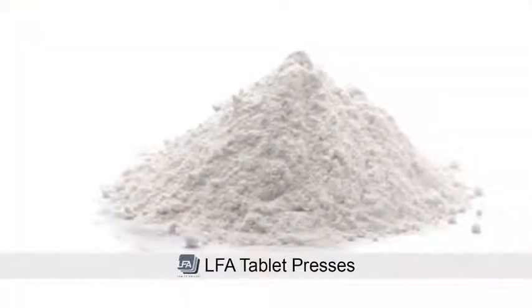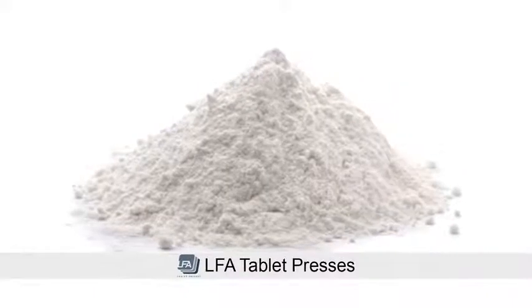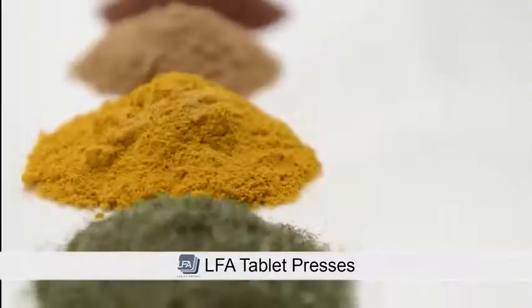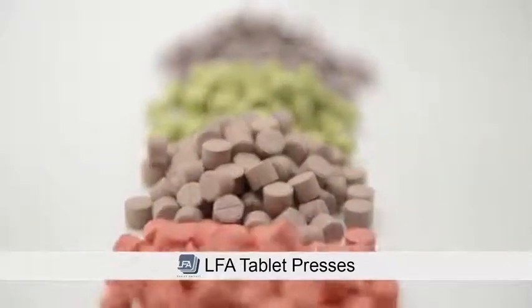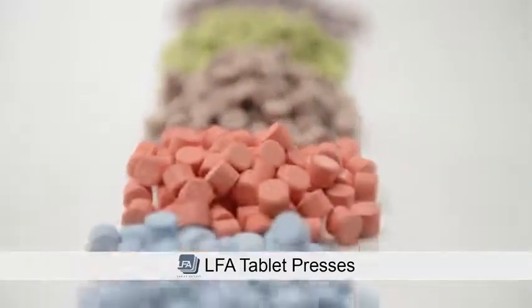We use inert pharmaceutical grade ingredients that work with 99% of products. Firmapress comes in a wide range of colors, which will help ensure that your product stands out in the market.